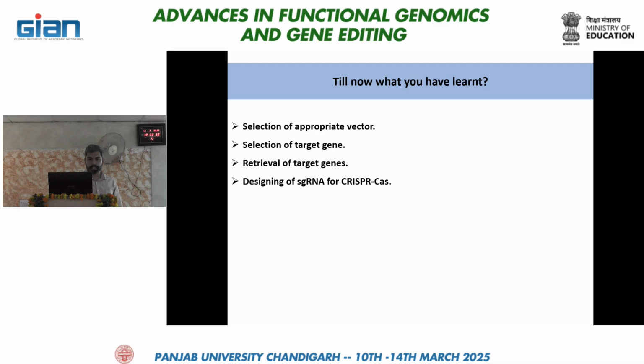Same retrieval of target gene and designing of single guide RNA. So using these tools we can design target sites, and the next step will be taken care of in tutorial 7. I think today is tutorial 7, so that will be covered in the next tutorial.